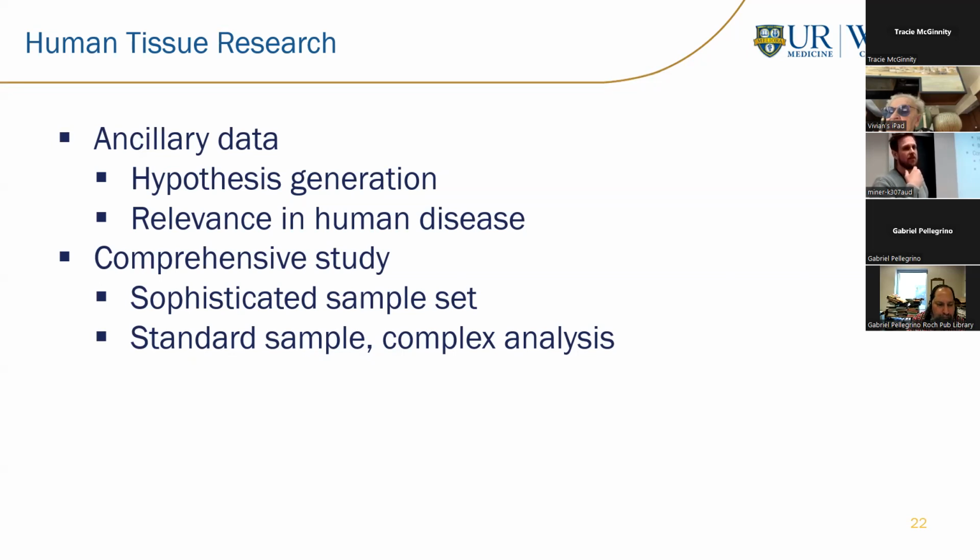Yeah, so we have a number of benign tissues in our database. As with everything else, if there's something lacking or something you want to collect that we haven't, bring it up to us. We're more than happy to add that to our prospective collection and start building those in. As I said, we're allowed to consent patients that are here for some level of disease. So we can also consent, perhaps, epileptic patients who are getting a brain resection for a normal control, right? We have those capabilities. I don't think we've gotten to the point where we're actively building that part of our bank, but we absolutely want to, and we want to get it started sooner rather than later if there's interest, and we're missing something that could be useful.